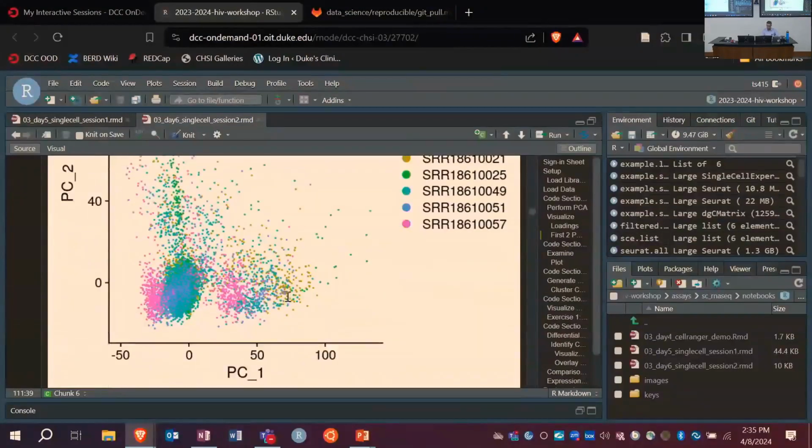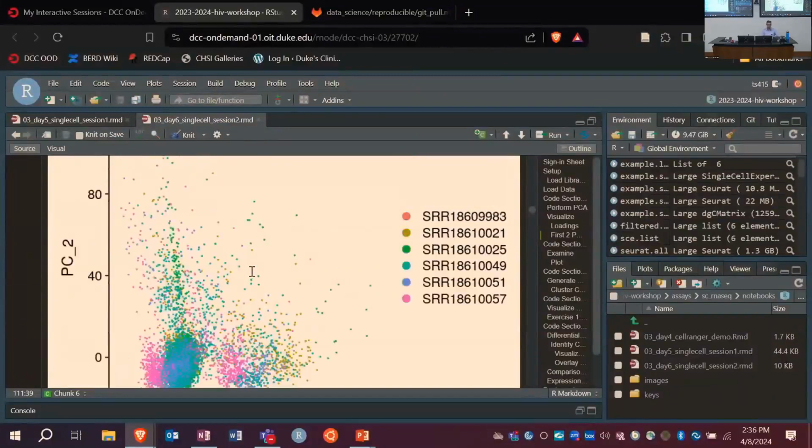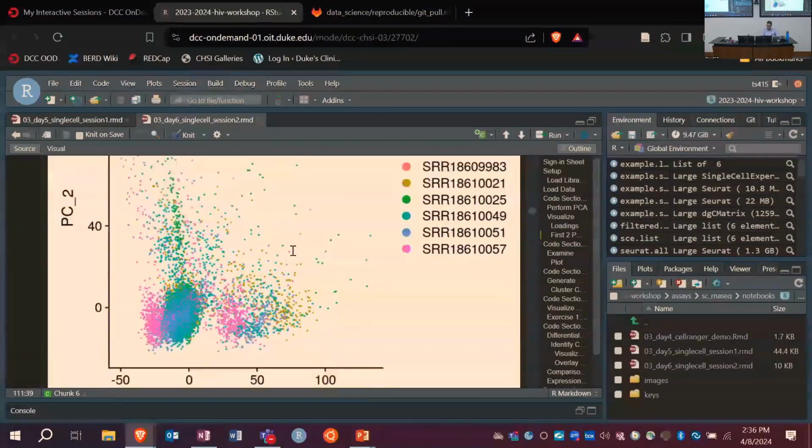And actually one thing that jumps out on this PC space, well, maybe 2 things. One is that things are not really clustered all that well in this space. I would maybe point to the fact that principal components is somewhat constrained to doing linear transformations, and so it can't necessarily always do a great job of finding these high dimensional clusters. And then the other thing you can notice is that things are clustered by sample to some extent.